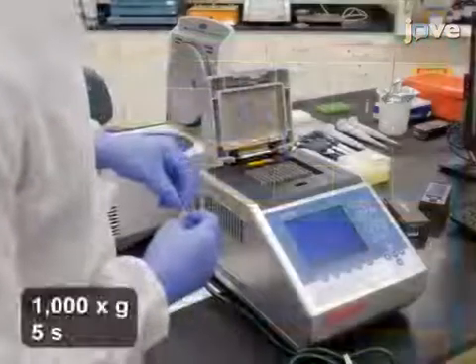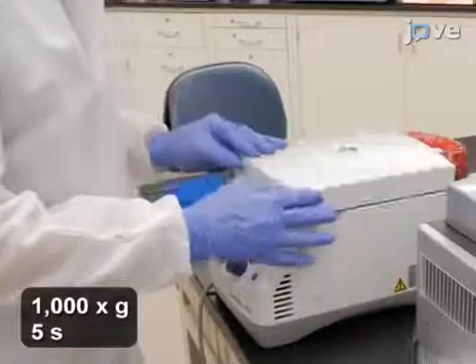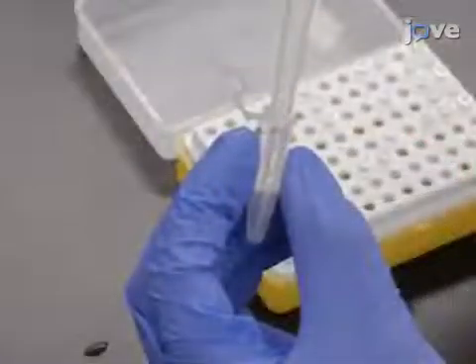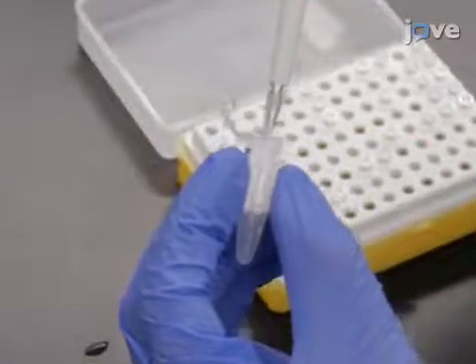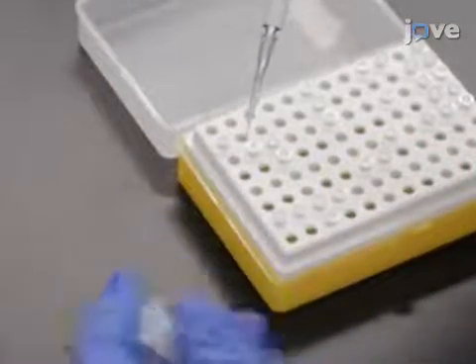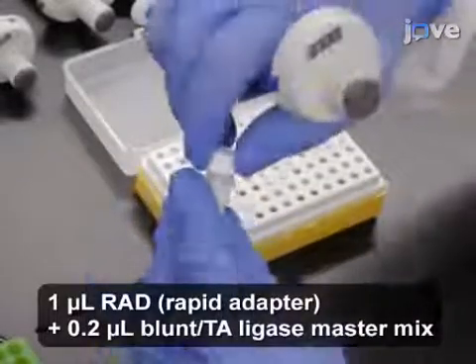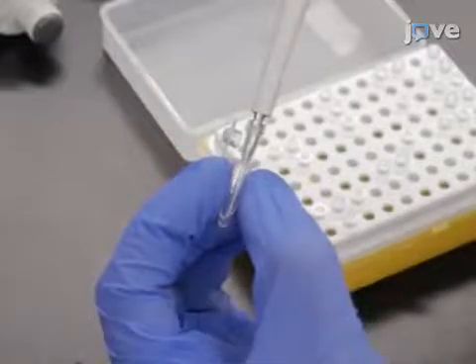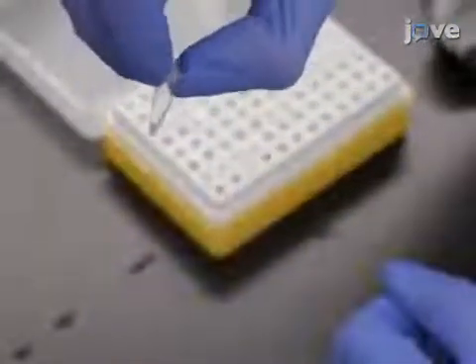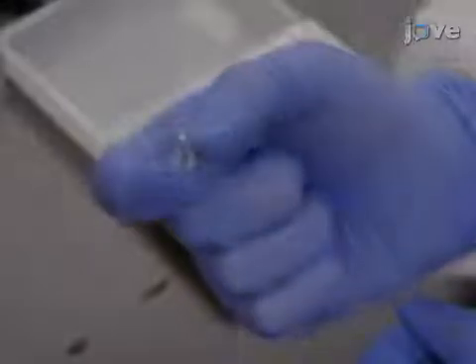Then, pulse-spin the tube again. To complete the adapted and tethered library, add 1 microliter of rapid adapter and 0.2 microliters of blunt TA ligase master mix. Then, use inversion to mix the tube.